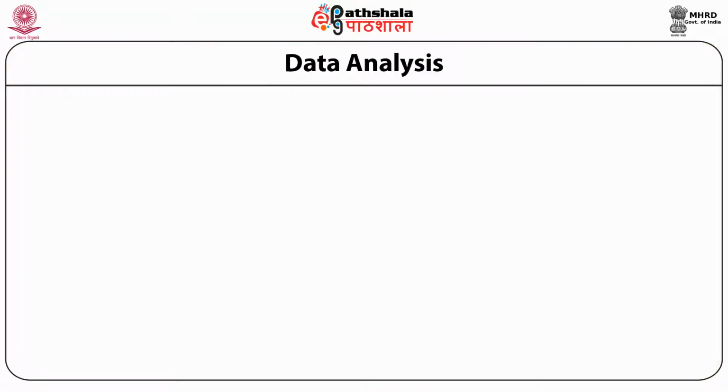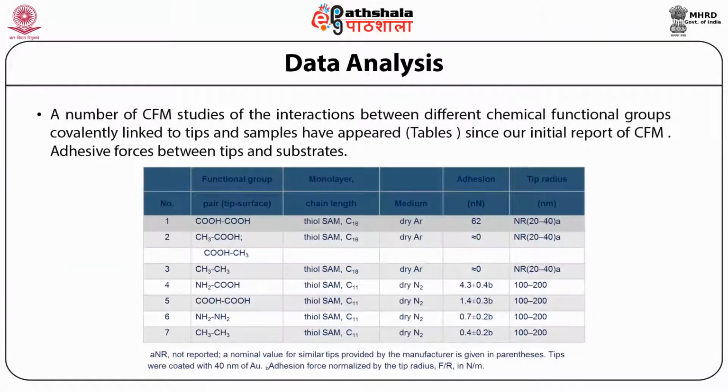We have been talking about chemical force microscopy. This can be very conveniently used to analyze the data, and this data analysis has been given here. A number of CFM studies of the interactions between different chemical functional groups covalently linked to tips and samples have appeared in the table given below.